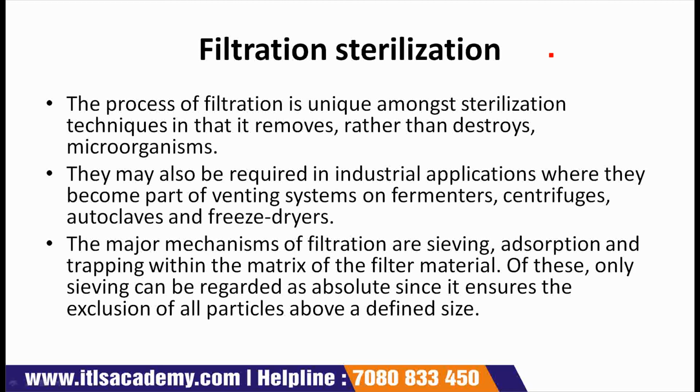Another type of sterilization we are going to study is filtration sterilization. So the very first point in filtration sterilization is, the process of filtration is unique amongst sterilization techniques in that it removes rather than destroys microorganisms.